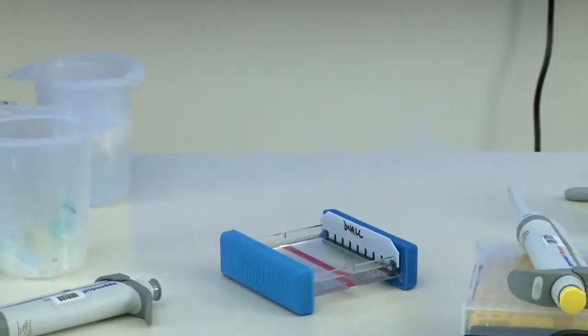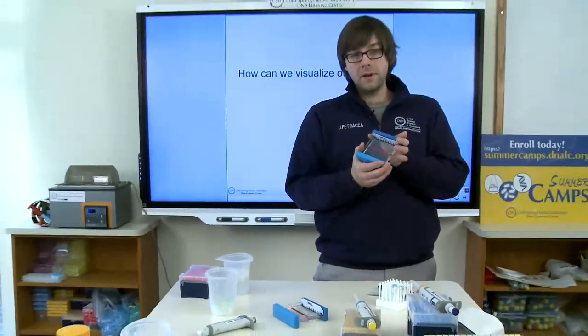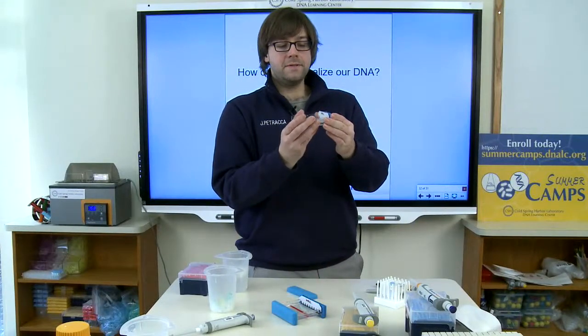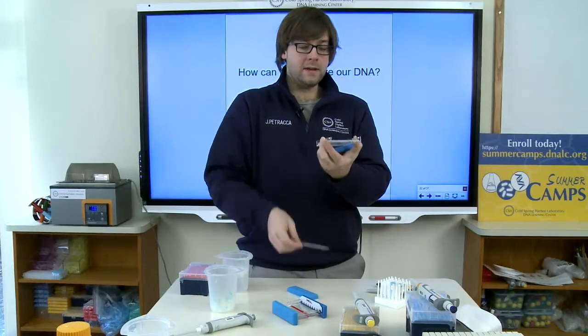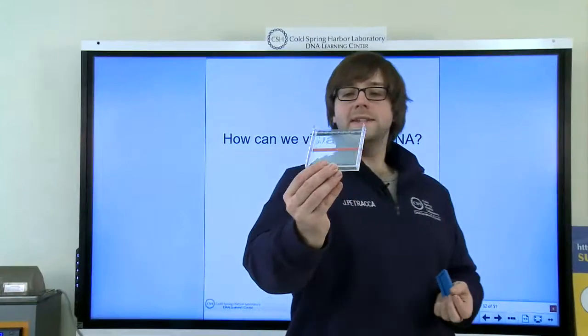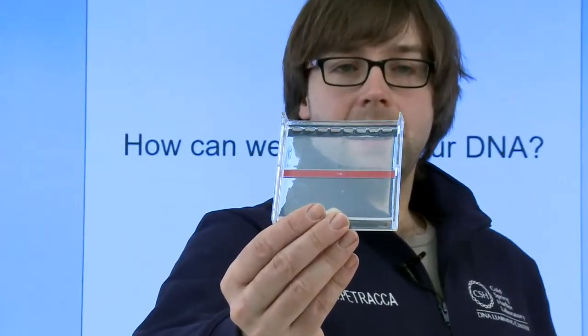So it'll take about 10 minutes or so for that gel to solidify, but I went ahead and already poured a gel for you guys, so it's right up here. So I'm going to take those blue ends off very carefully. And voila. There you go. We have a nice little gel. So if you look directly down on it, you'll see that there are 8 little wells very clearly indicated in the gel there.